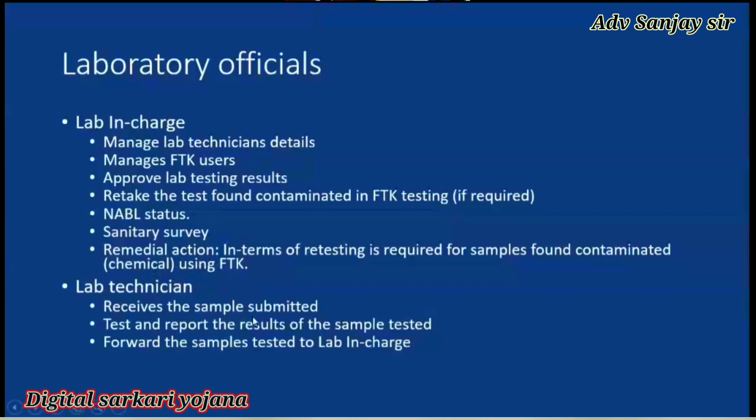Then the lab technician receives the sample submitted. From whom has the sample been submitted? From the sample collectors. Then he tests the samples, reports the results of the sample tested, and forwards the sample tested to the lab in charge. Until and unless the lab in charge approves the sample tested, only after approval of the lab in charge is the report generated. So these are the roles of laboratory officials, lab in charge and lab technician.